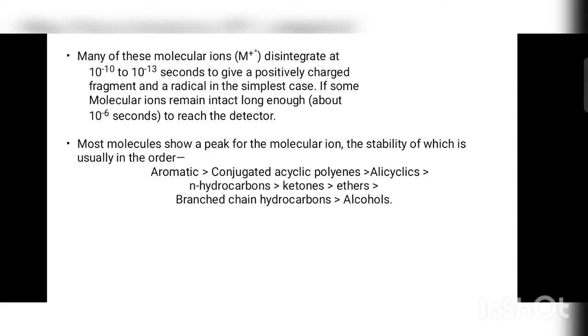Many of these molecular ions disintegrate at 10 raised to minus 10 to 10 raised to minus 13 seconds to give the positively charged fragment and the radical in the simplest case. Some molecular ions remain intact long enough to reach the detector. To reach the detector, the time limit is 10 raised to minus 6 seconds.